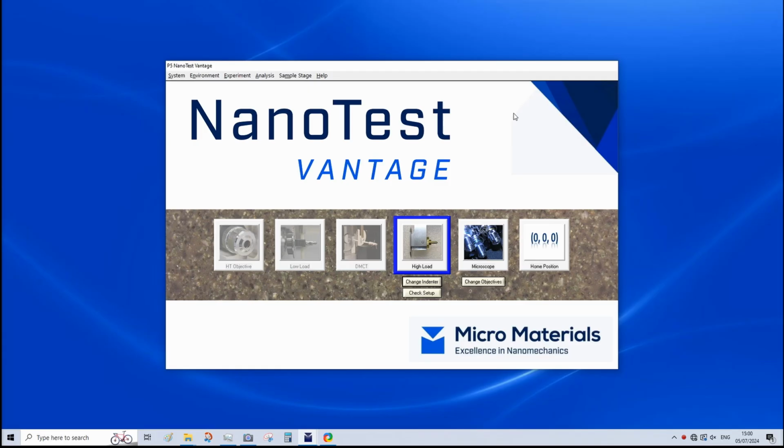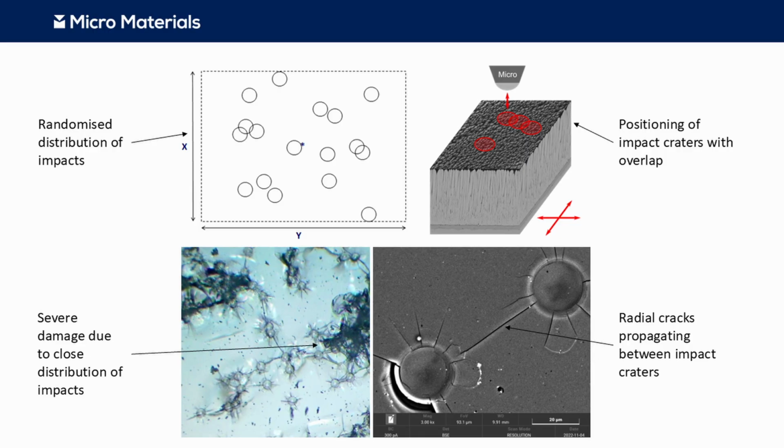Okay, now we've seen a typical repetitive impact test, we will explore the randomized impact test method. The randomized impact test allows a programmed number of impacts to be distributed within a specified region of the sample in order to directly study how damage from one impact affects subsequent damage.